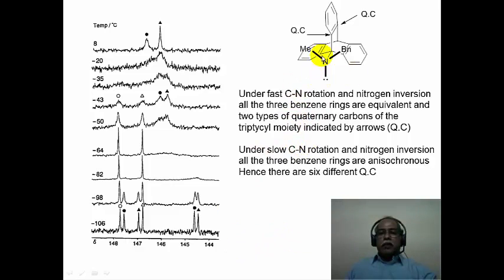If the molecule is undergoing rapid rotation and the chirality is lost as a result, then the 3 carbons in the front and the 3 carbons in the back should each come as a single signal. So essentially you see 2 signals, one corresponding to the carbons in the front, the other corresponding to the carbons in the back side of the molecule.